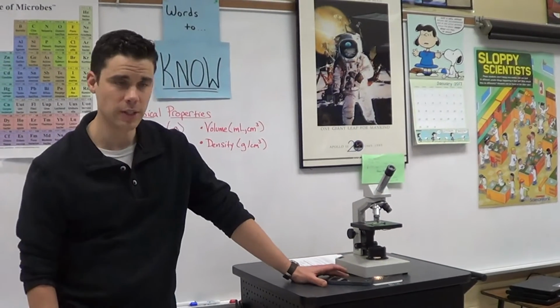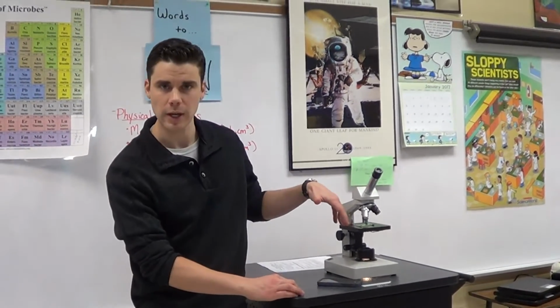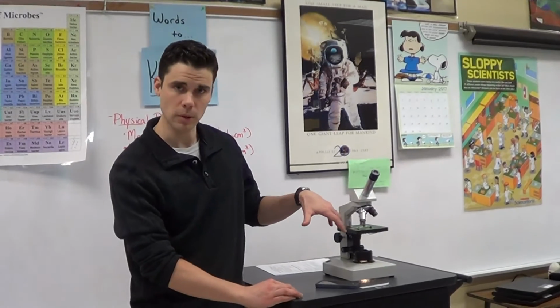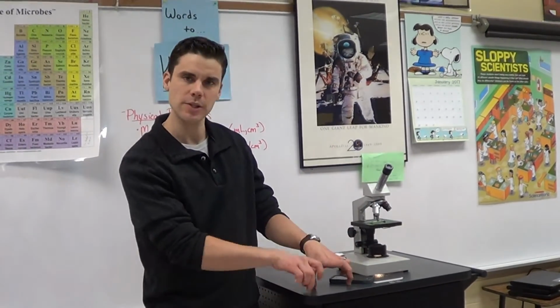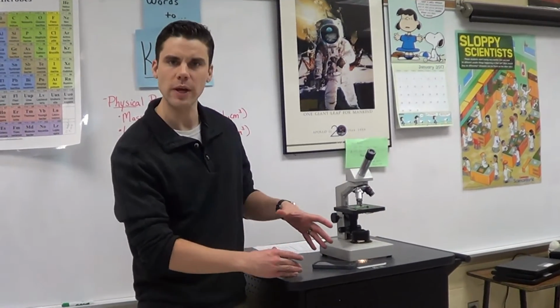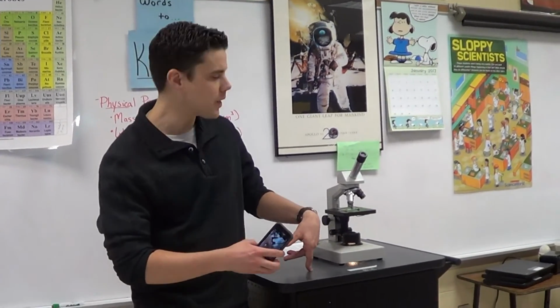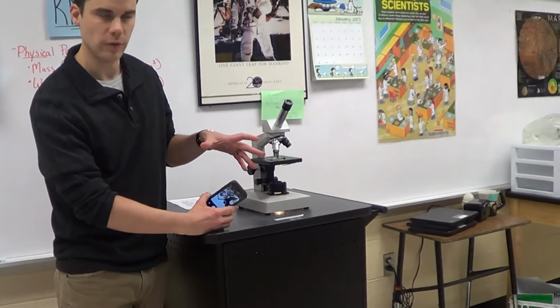In the Cells on Mars activity, students are using microscopes to look at authentic samples of plant and animal tissue. They will use this to compose a profile where they are looking at similarities and differences between those two cell types. Students have no prior experience, so they're using their observations to determine those similarities and differences. One crucial step in that process is recording their observations.